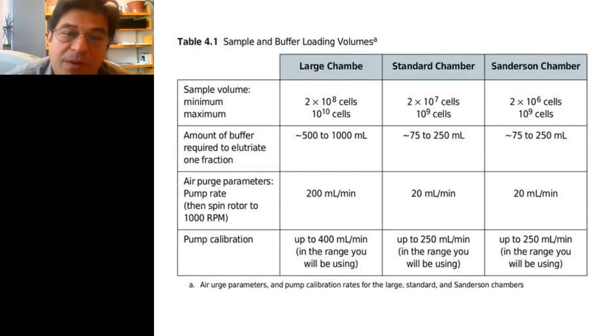There is some drag effect here because you do have a fluid flow. It's really the sedimentation velocity that's the prime component of the technique. You can exploit some of these differences by changing the buffer and actually putting gradient type buffers into the system. These things can certainly be played with. A lot of this is just determined by the experiment. So I would not dismiss any of these possibilities. I would certainly try them out, especially if you can do it in a controlled way.